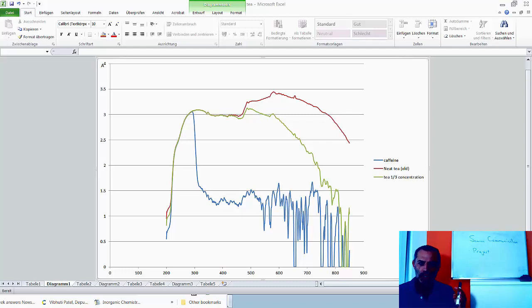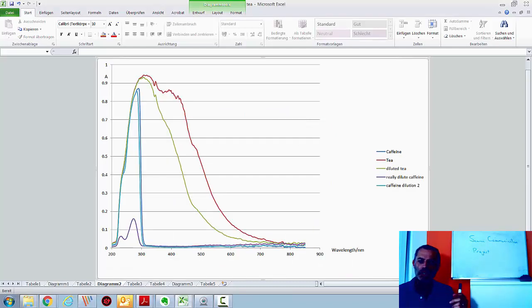So now it's absorbance again but this time I've diluted the tea again and I measured it more carefully, and I've allowed it to equilibrate more and I used a much more diluted version. And what we can see is the caffeine is the same shape as before but the end at the higher wavelength is much smoother. So that's good, I managed to get that to work properly. If we take some tea it goes up in absorbance and then where it was cut off and went weird before I can get it to show better.